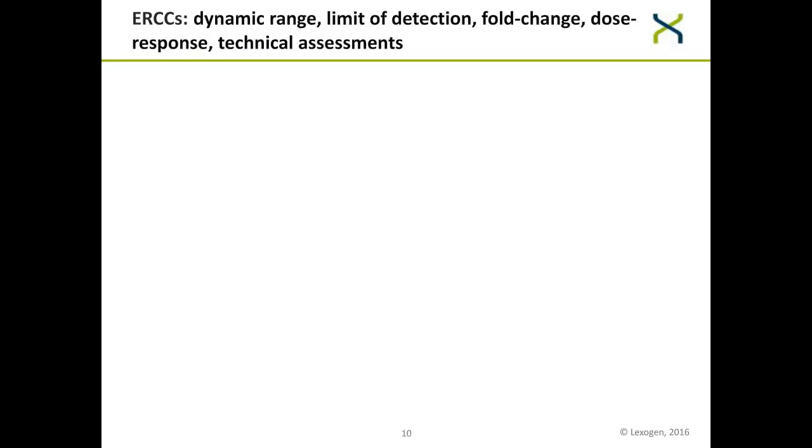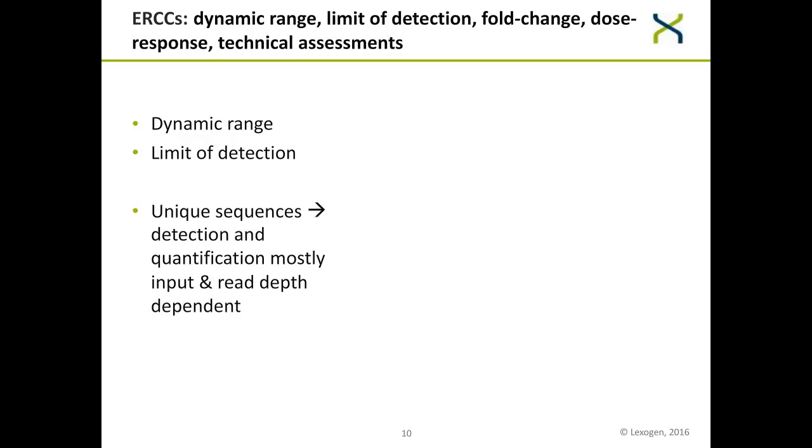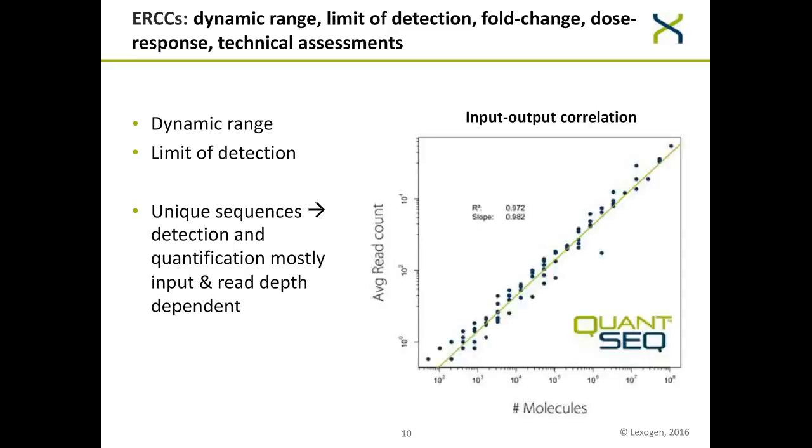So this very initial generation of spike-ins, what can you use them for? You can use them to detect your dynamic range and your limit of detection. You can assess fold change, dose response, and many other technical assessments. I will show here only the dynamic range assessment.